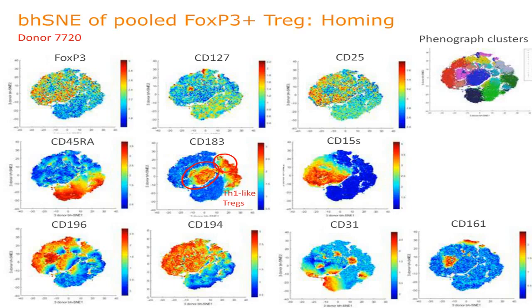And so all of these algorithms are kind of working together, telling us more about our cells of interest and how they may be subsetted in a high-dimensional space. Because no longer are we just hierarchically gating down into different subsets. It's taking all of that information and using all of the markers that we wouldn't even think about, that may be important for identifying these cells of interest.